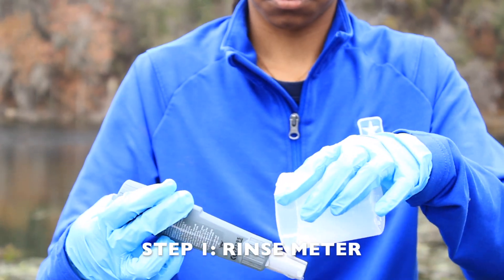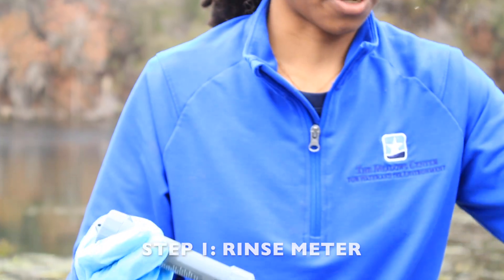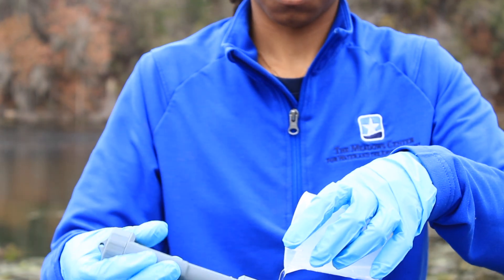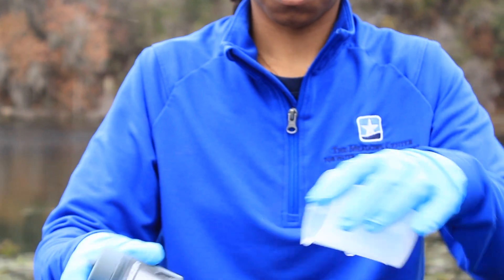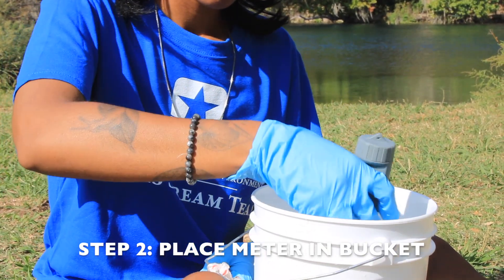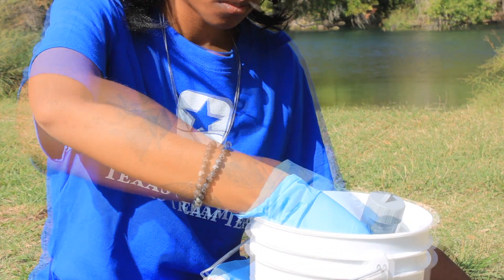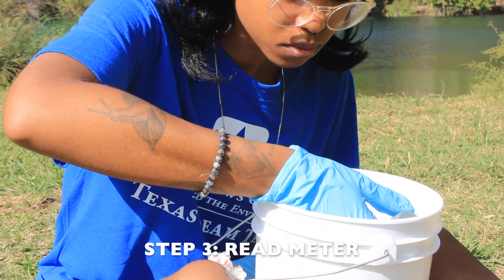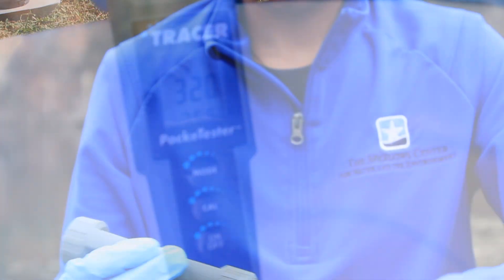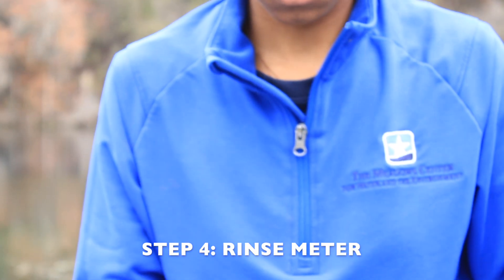For step one, rinse the meter twice with the sample water to avoid contaminating the sample bucket. If you are using a beaker to assist with rinsing, be sure to also rinse the beaker. For step two, place the meter in the sample bucket for one to one and a half minutes. For step three, read the meter while in water to the nearest 0.5 degrees Celsius. Never take the meter out of the water to read the temperature. Lastly, be sure to rinse the meter twice with DI water.